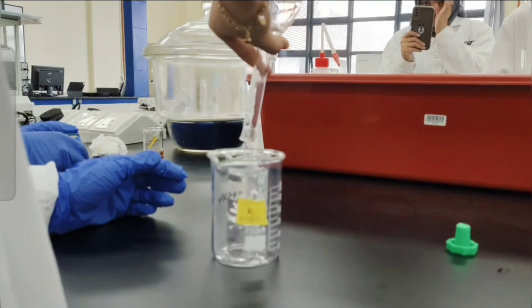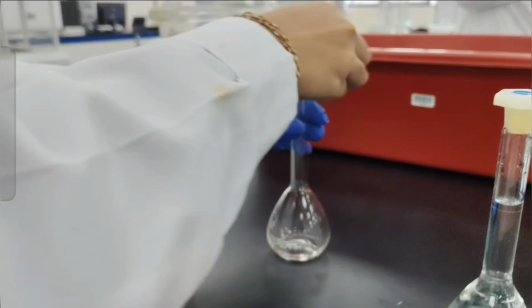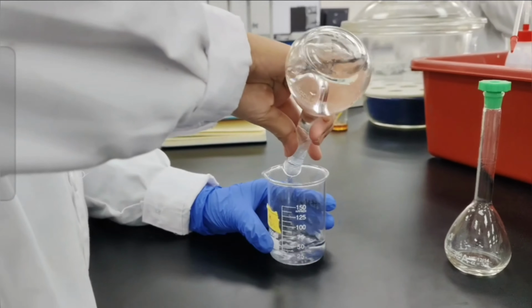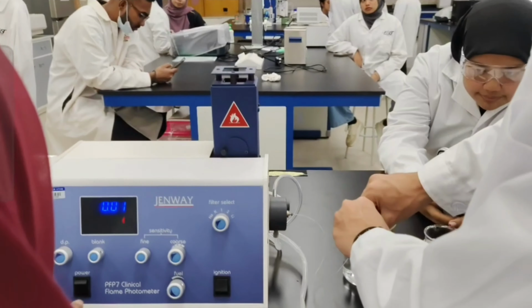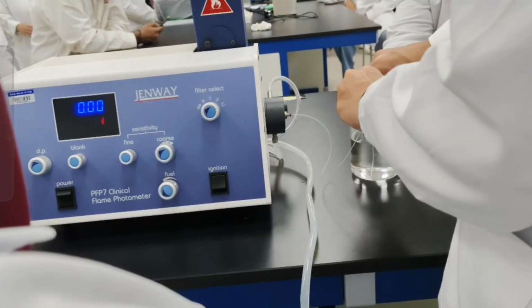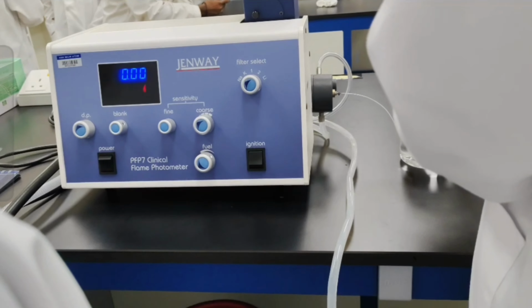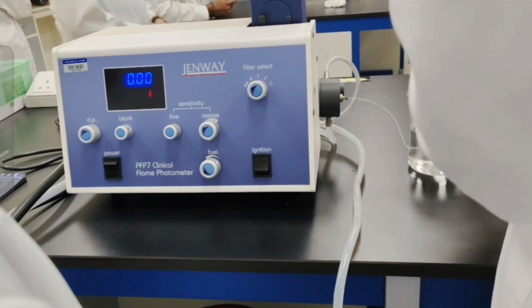Then we transfer the stock solution to a more suitable container so that it is easier to be analyzed by the instrument. In this case, it's a beaker. First, we rinse the instrument inside using distilled water, so that there is no contaminant inside the instrument when we analyze the sample.